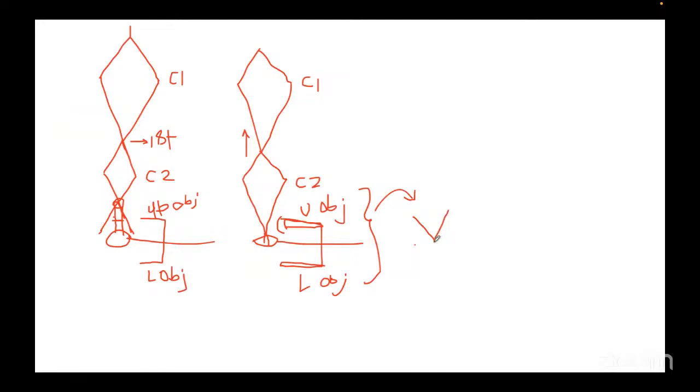This is the converging point and this is my sample. When the electrons come out, this is my upper objective lens and this is my lower objective lens. We use the upper objective lens current so that the electron beam comes out and goes as a parallel beam. A very small portion will be exposed, and the beam will be parallel like that.